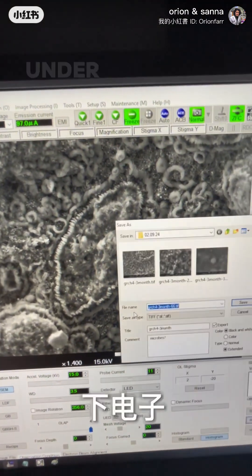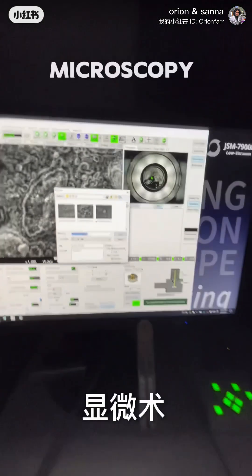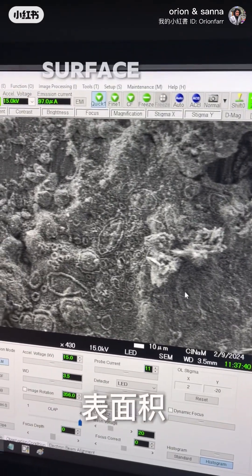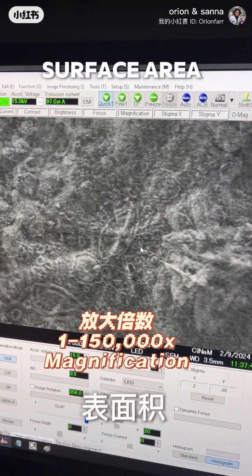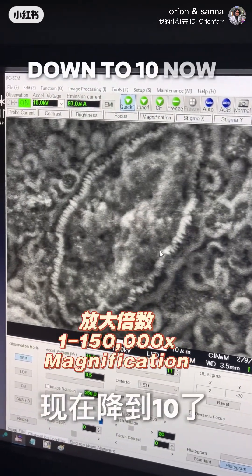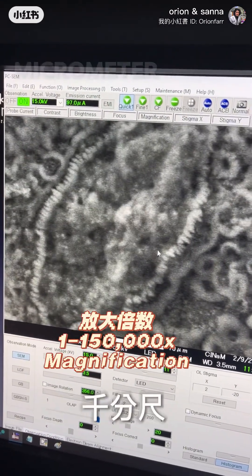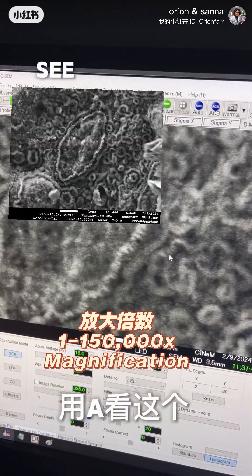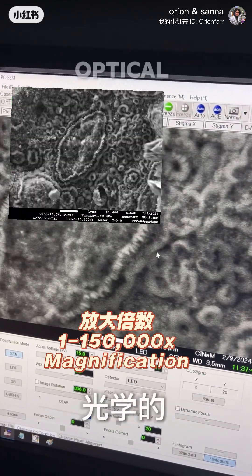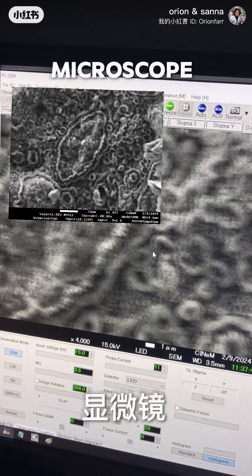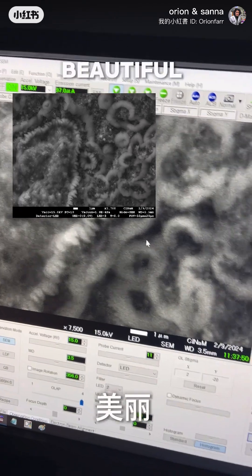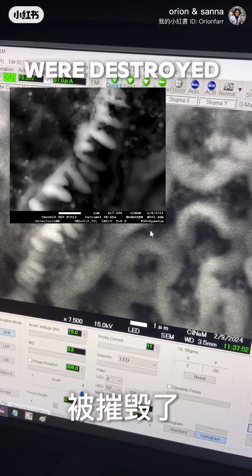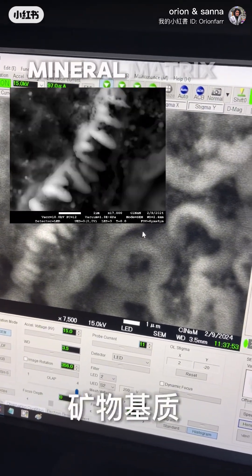Here we have what we can see under electron microscopy. It's a very small surface area — down to 10, now down to 1 micrometer scale. You can't see this with a conventional optical microscope. You can see really beautiful details of these cells that were deposited over this mineral matrix.